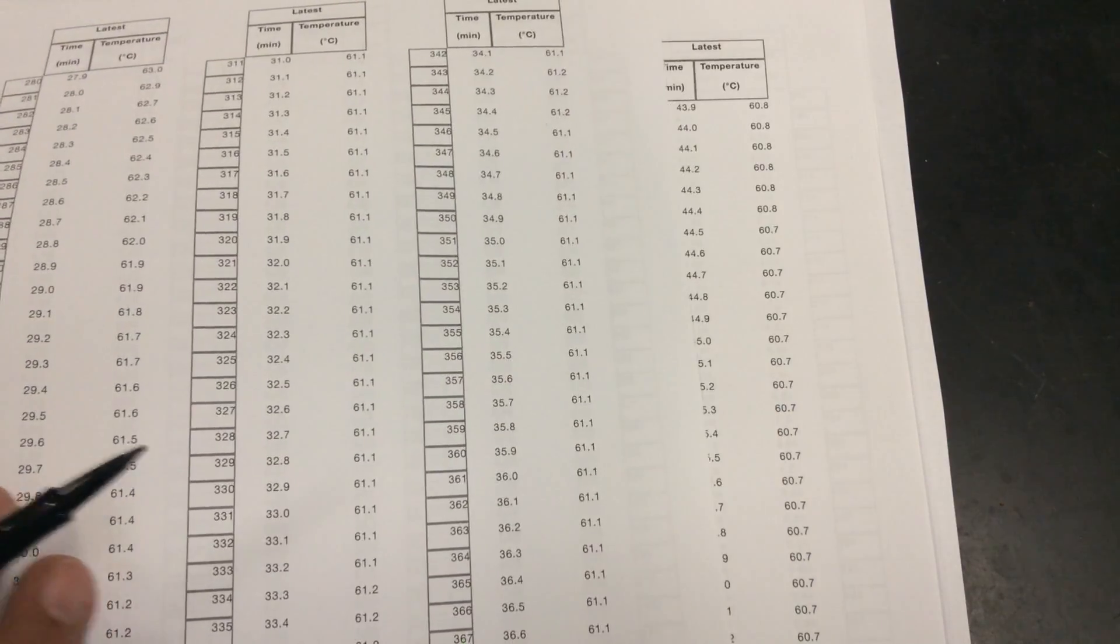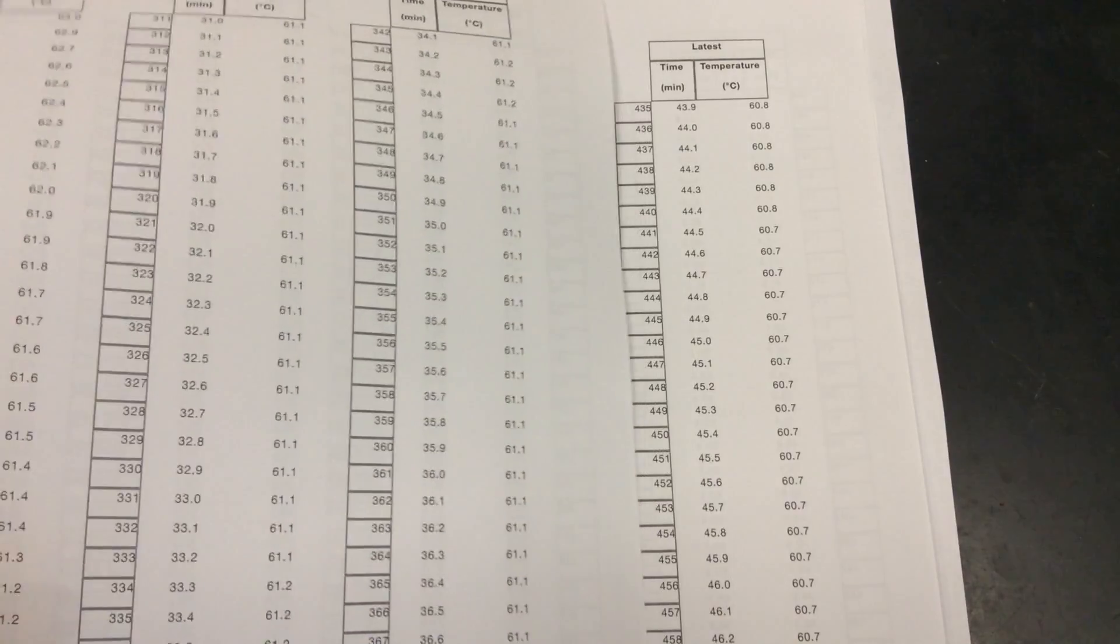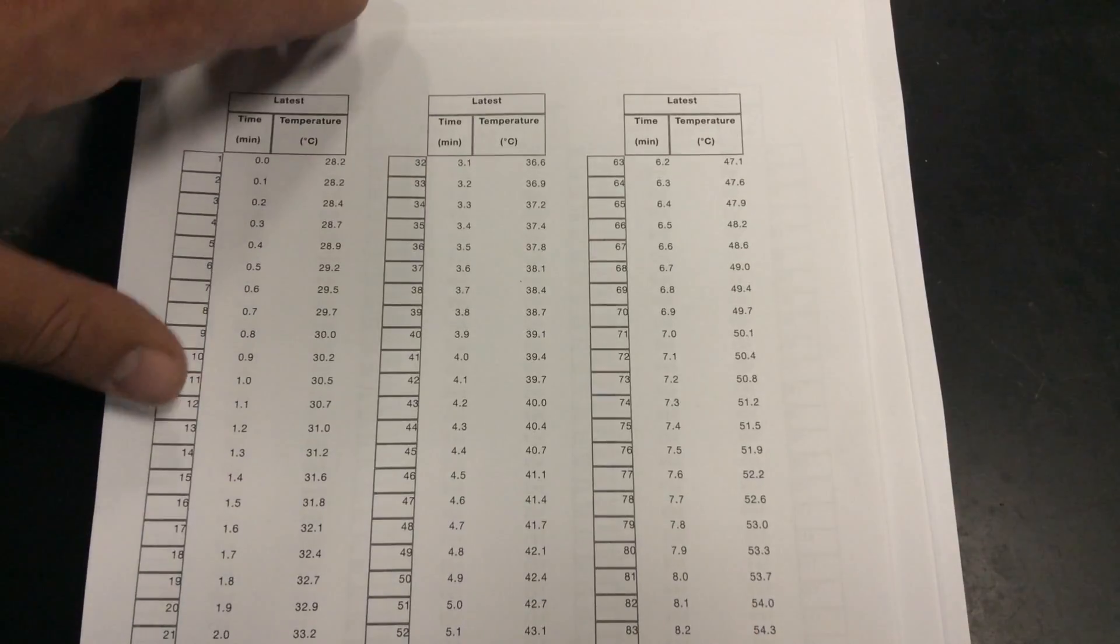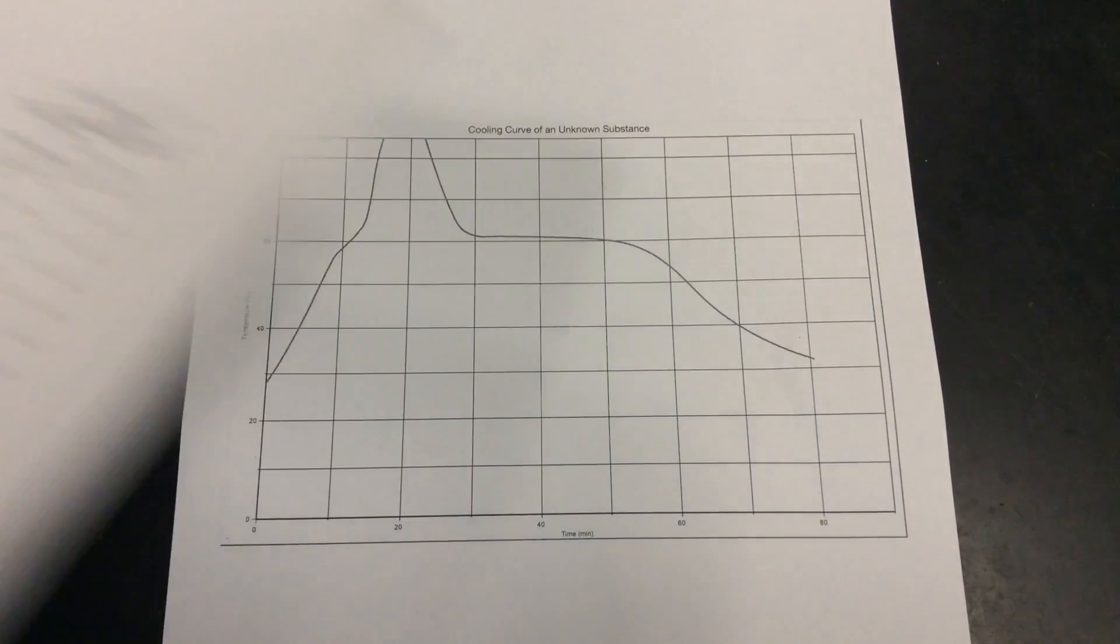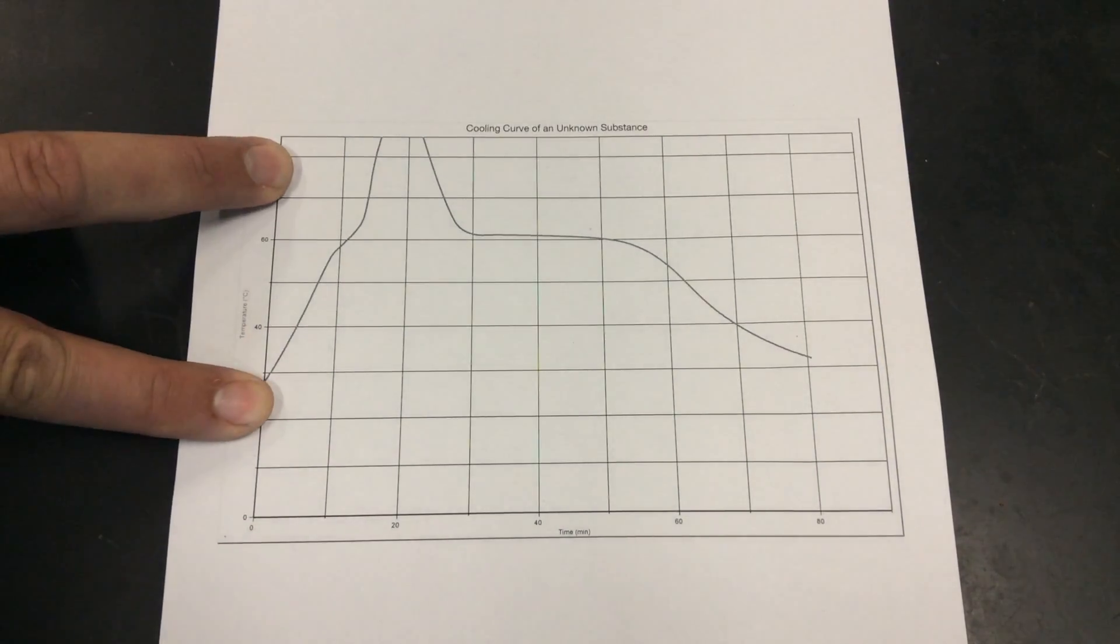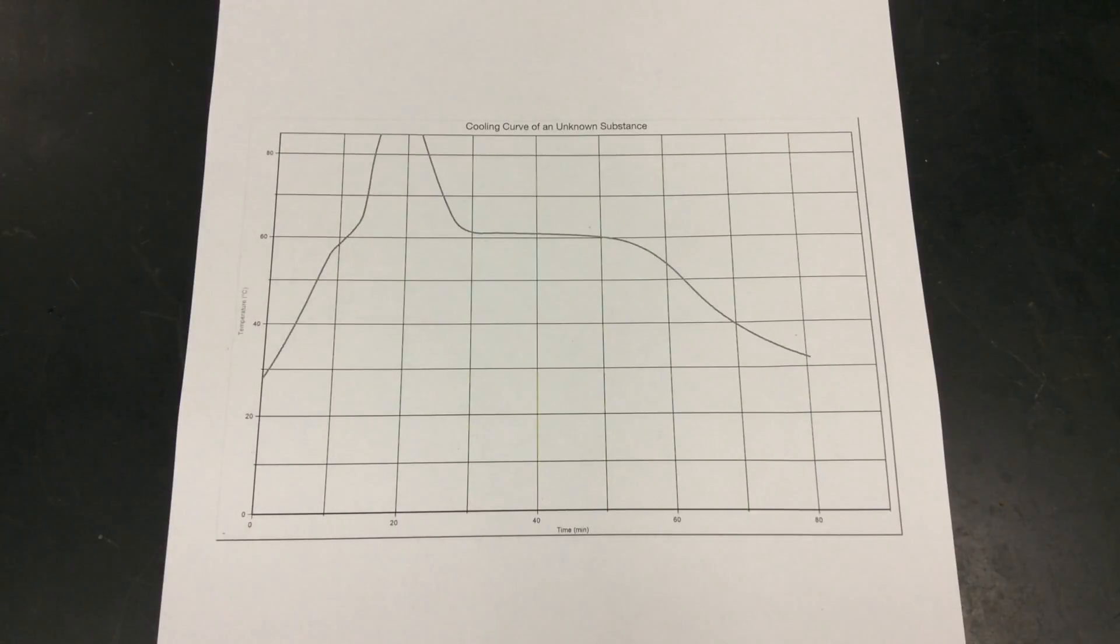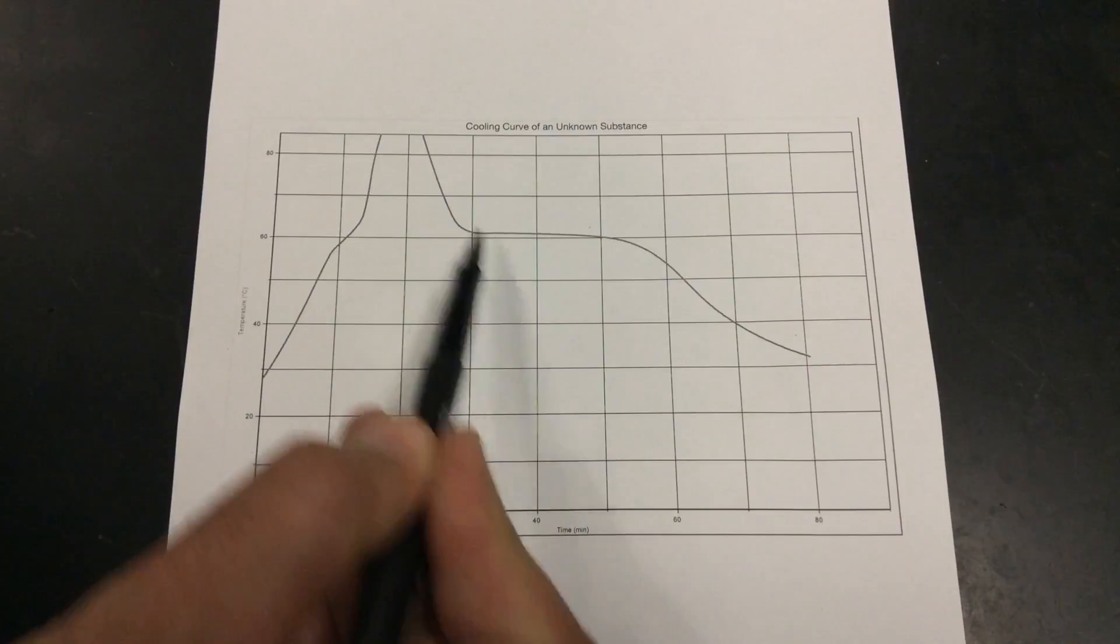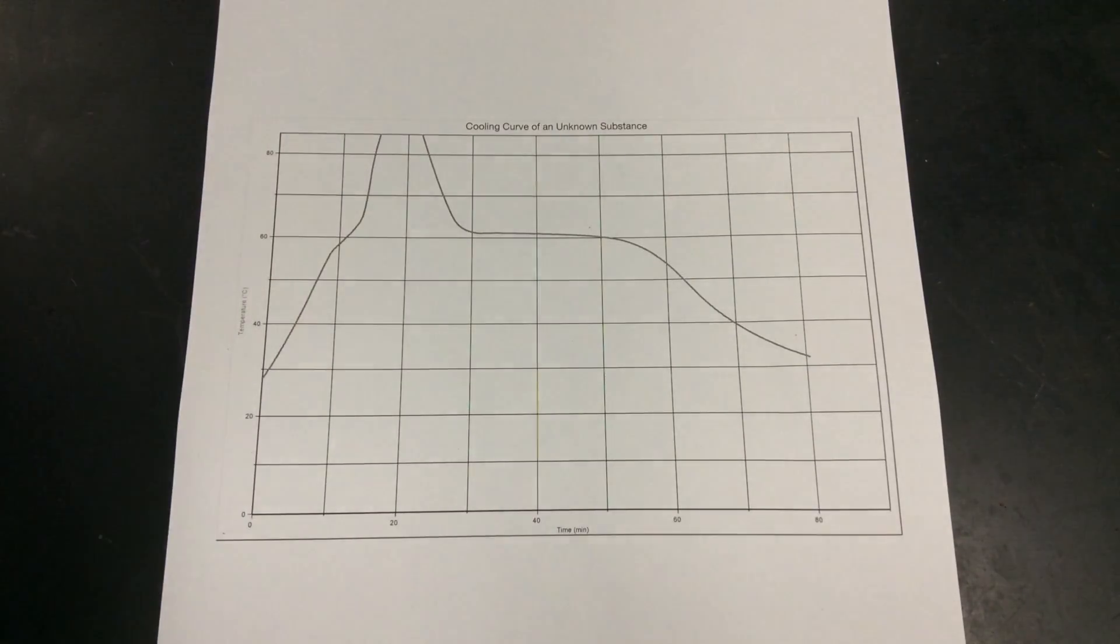Where they stay the same the most is what your actual melting or freezing point temperature is. I want you to circle them. I want you to just take the page that shows the temperatures that are staying the same the most, circle them, and attach it behind your graph. The values that you just circled, which represent the time and place where you think they're staying the most constant, that's your experimental melting point.